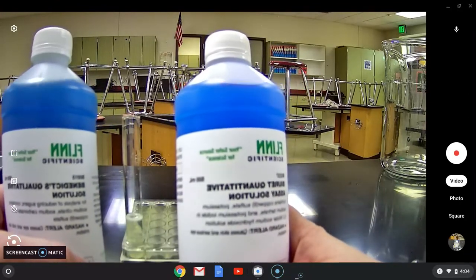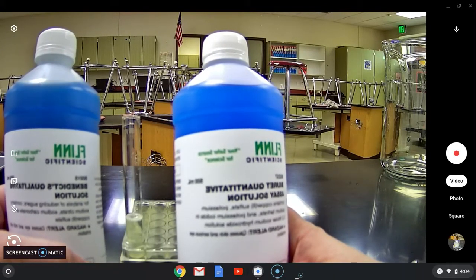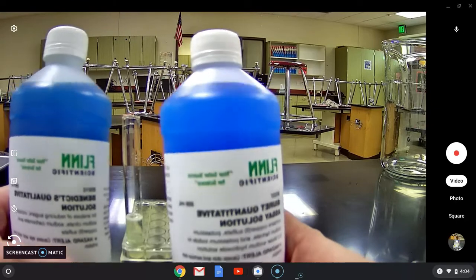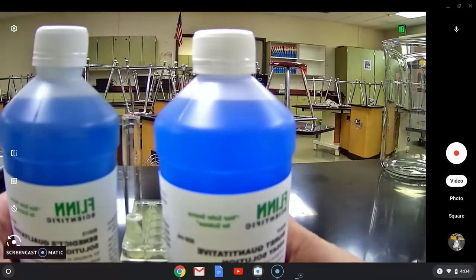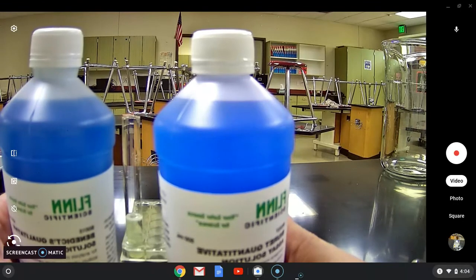So if you were doing this lab in person you would want to make sure you would keep these very securely labeled so that you can tell them apart because yes there is a difference in their color but it is very close.